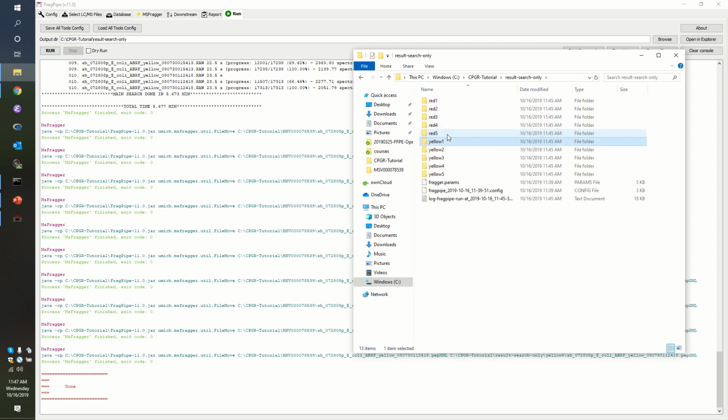Okay, so you remember that we had labels read 1 through 5 that we put on things. I mentioned that we had a configuration file and so on, and a configuration for FragPipe itself, and we have a log where the software tells us all the things it did along the way. So this result is pretty clean, really.